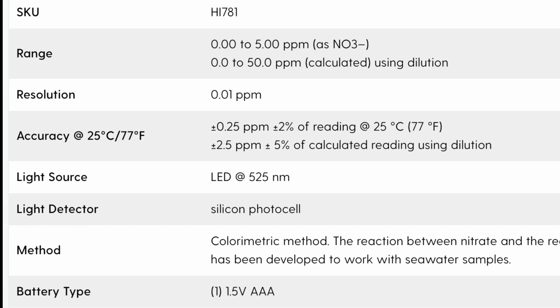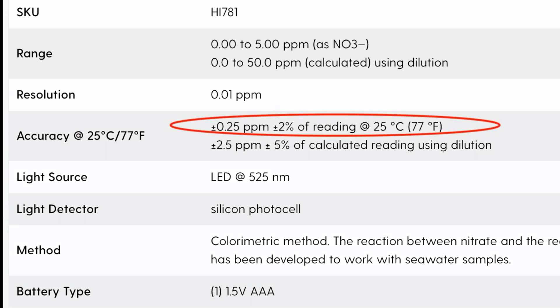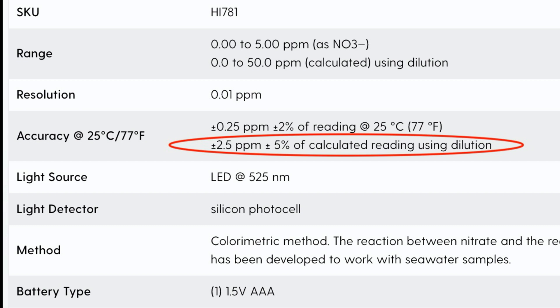According to HANA, at 77 degrees Fahrenheit, when you do the 0 to 5 parts per million test, there is a margin of error of 0.25. So if I really had 5 parts per million, it could read anywhere from 4.75 to 5.25. Now when you use the HANA checker to test for 5 to 50 parts per million, which involves diluting your test water, it's a margin of error of 2.5 parts per million. So in that case, I would get a reading anywhere from 2.5 to 7.5 for water that truly has 5 parts per million nitrates in it.